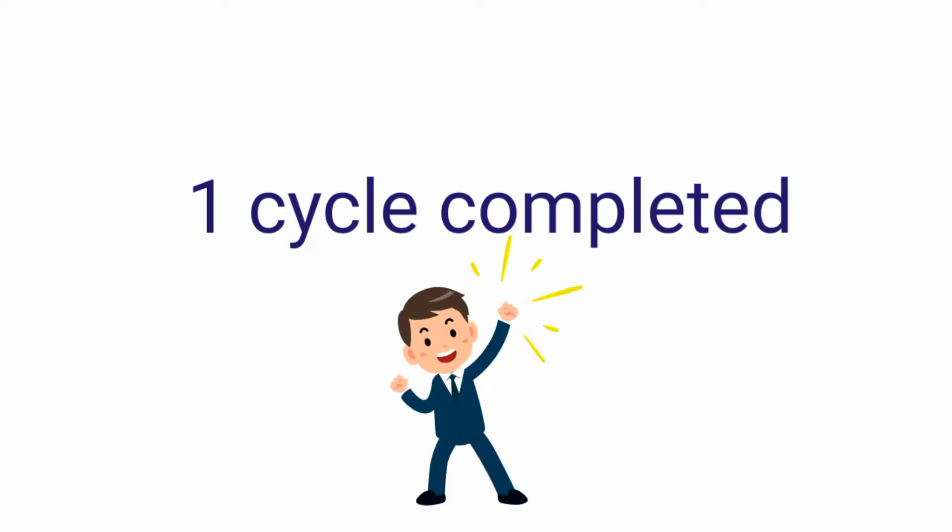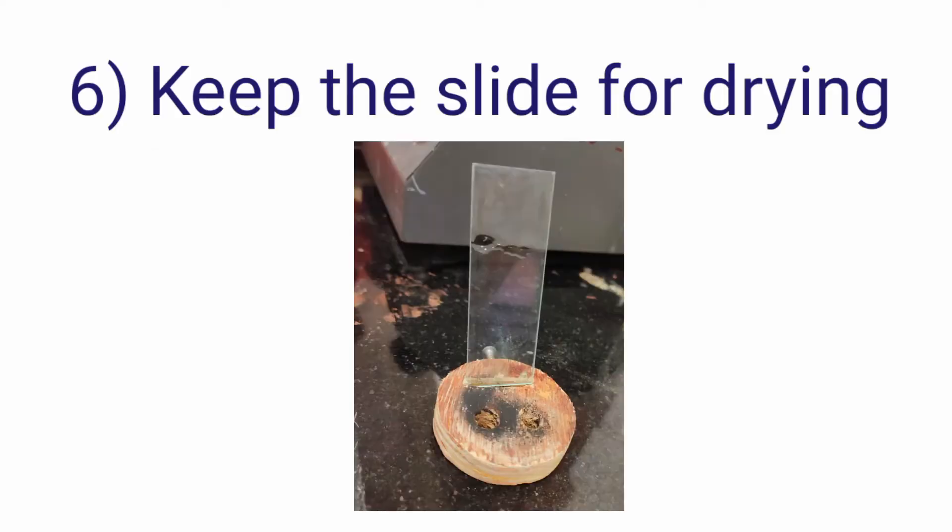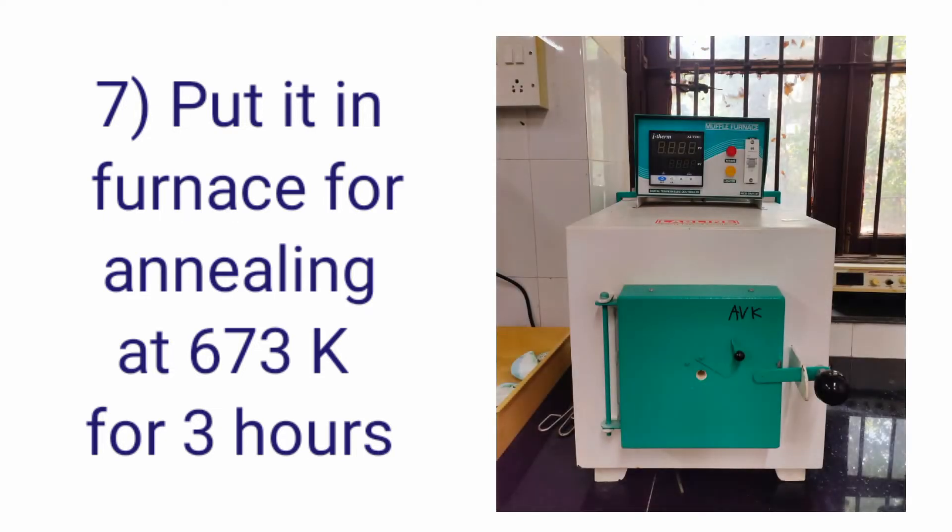This completes one cycle. In this manner you need to do 40 cycles. Once 40 cycles are completed you will keep the slide aside for some time so that it dries. Now you will keep it into the furnace for annealing at a temperature of 673 Kelvin for about 3 hours.